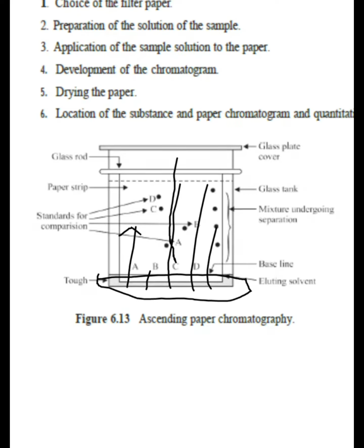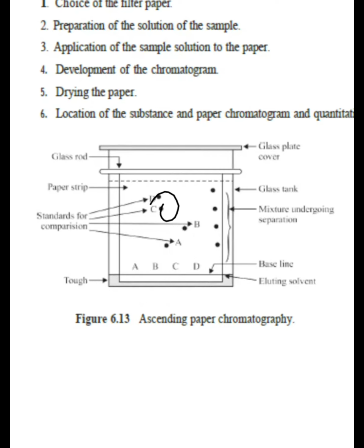It moves upwards, and these points are automatically denoted with different compounds. It can be seen here.